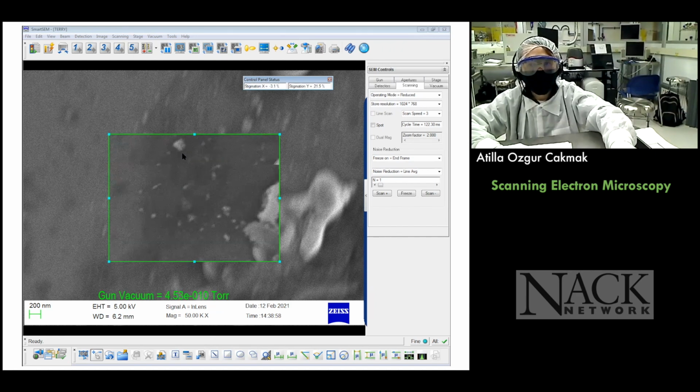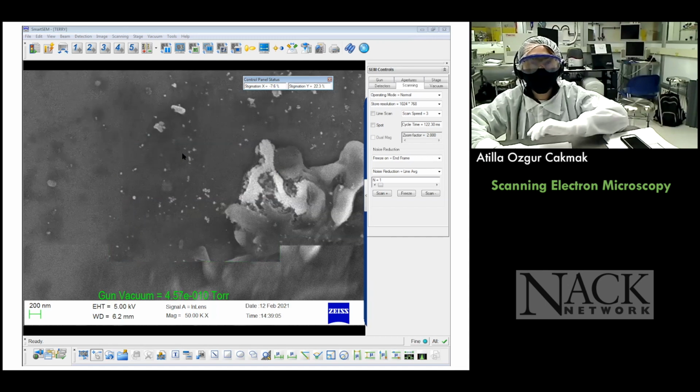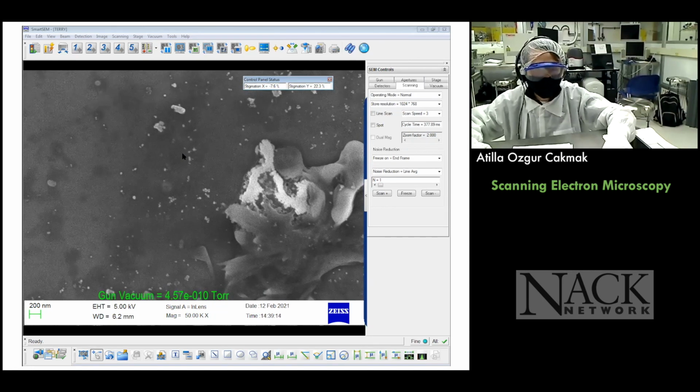I also see the little scale on the bottom left that says 200 nanometers for that size. Absolutely, right. Okay, so this looks a bit better. So now are we seeing the nanoparticles? Yes, those are those little tiny objects, but we still have to magnify more.